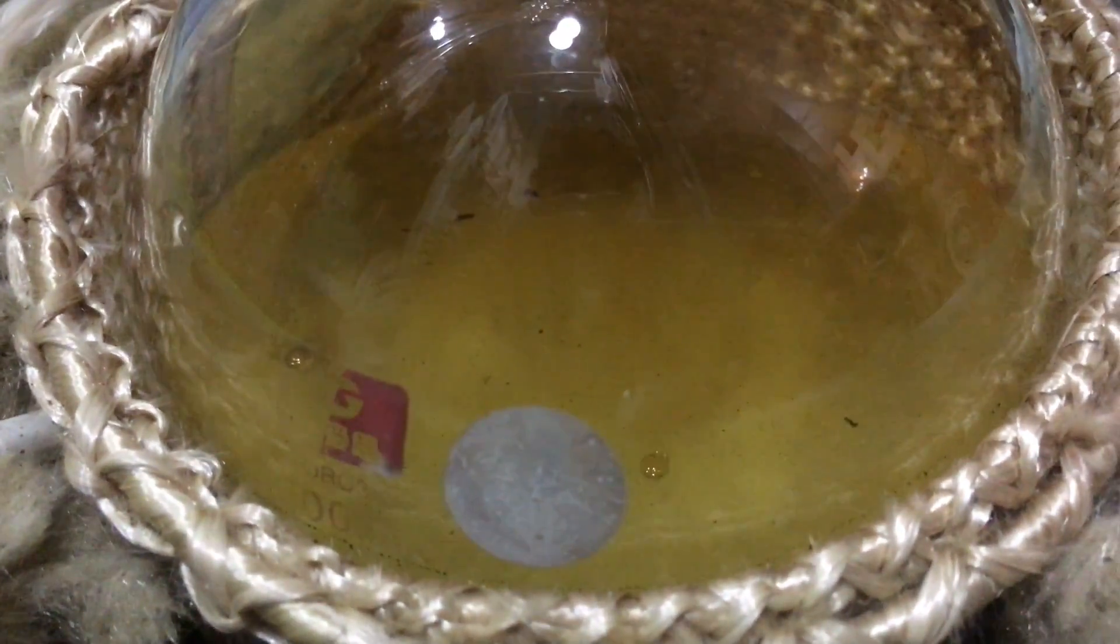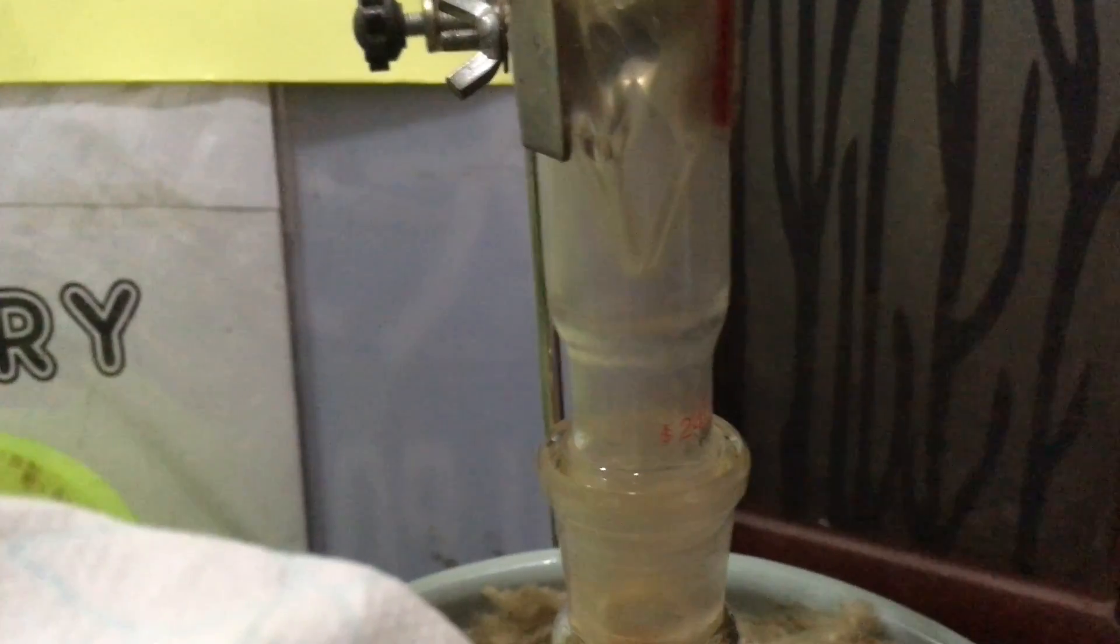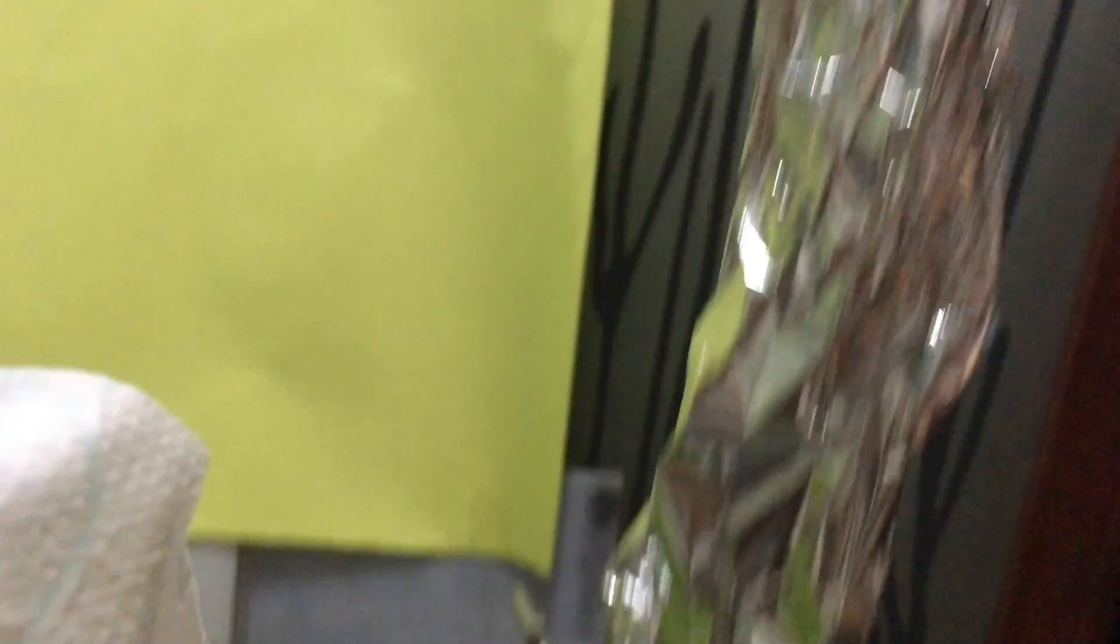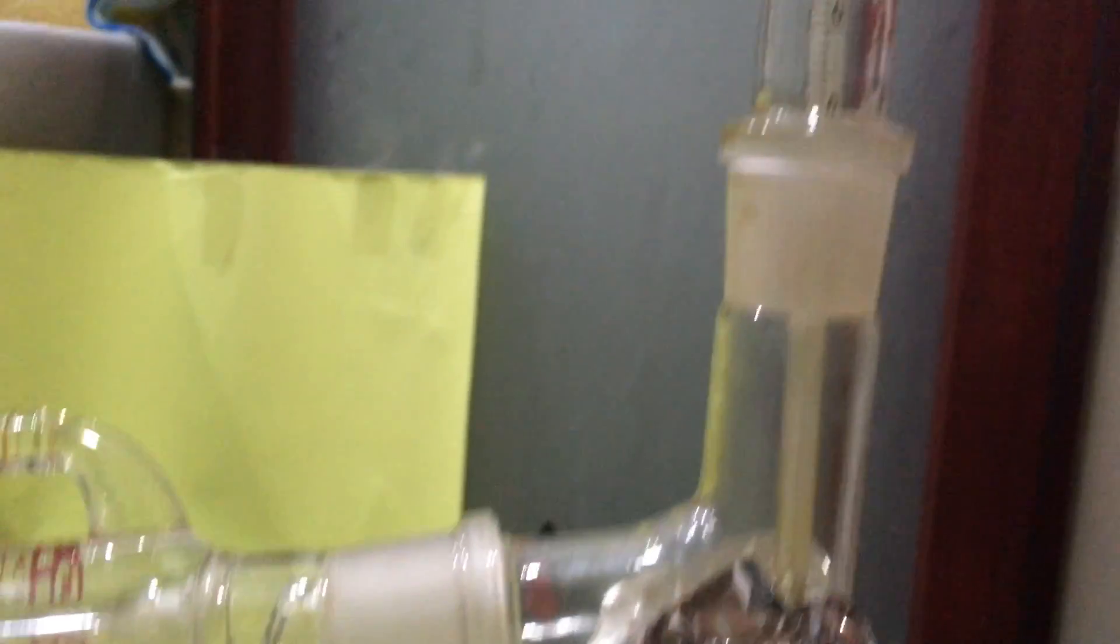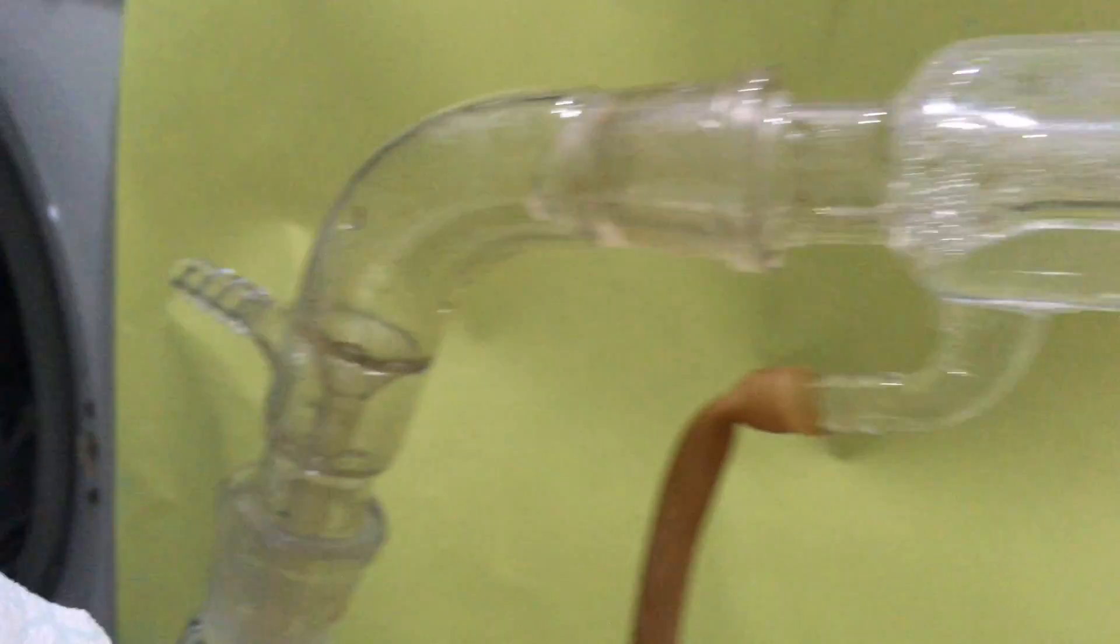Sorry for the shaking hand. By the way, a fractional distillation system is set. I used some aluminum foil to insulate the fractionating column so as to save some energy. Let's have a tour on it. Condenser, and the receiving flask.